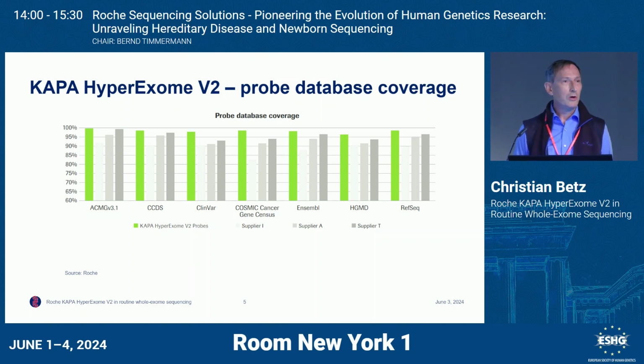We all look to these when we check our variants for pathogenicity. And in those databases, of course, there are not only coding variants, but also variants in regions that are intronic, for example, and even those contents were actually used by Roche to be added to the content. So even if a known pathogenic variant would be intronic, you could still cover it with the exome analysis.